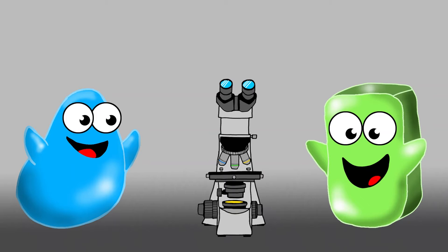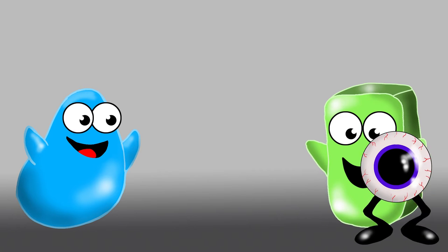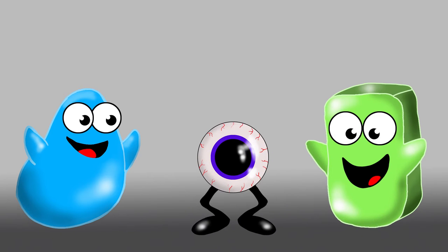So, Sylvia, what exactly are microscopes? Microscopes are tools used by scientists to help magnify objects that they want to study. You can use them to look at almost anything that is too small to see with the naked eye. It's kind of like a way for scientists to explore an entirely different world.